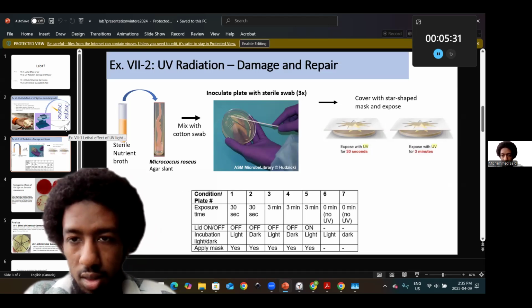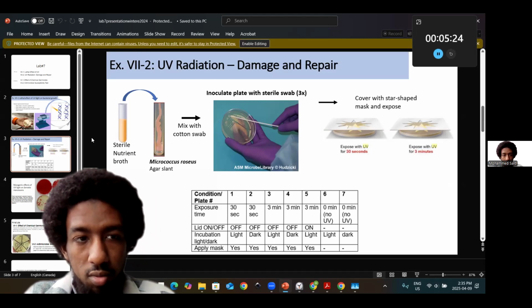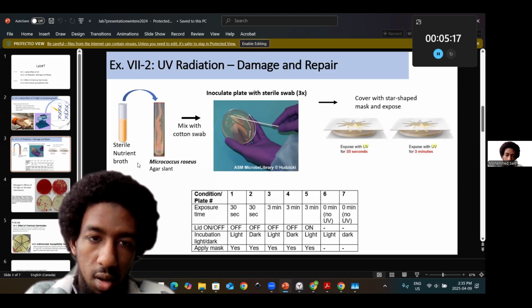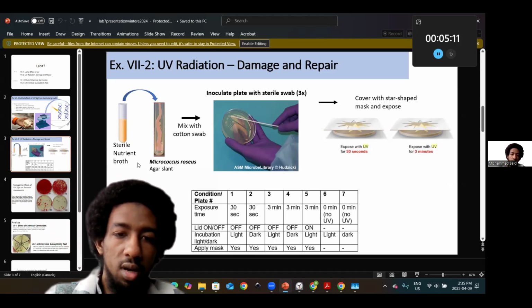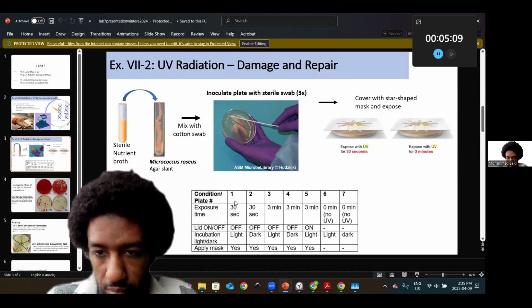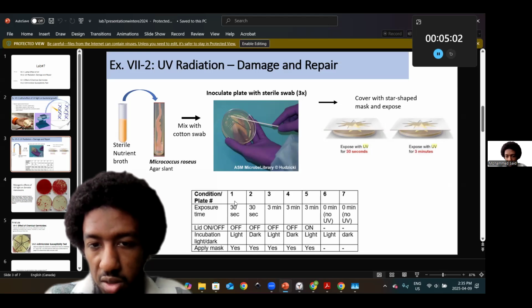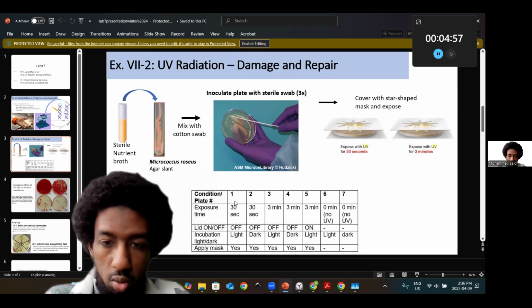So nonetheless, you have that mechanism, and something to bear in mind in terms of the setup is that you would have, unlike in the previous exercise, done them for 0 to 30 minutes with 5 minute increments roughly. You would have had, in this regard, shorter incubations, right? So that makes sense if you wanted to see the impact of repair, because obviously you're growing these bacteria over a longer duration post incubation overnight.